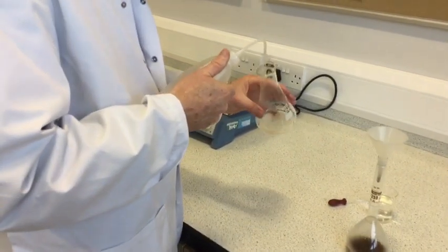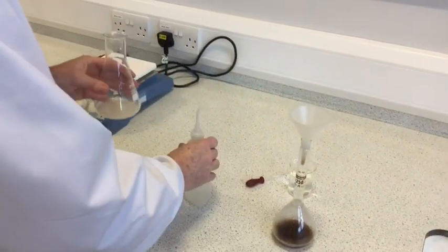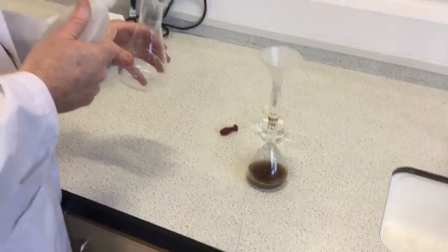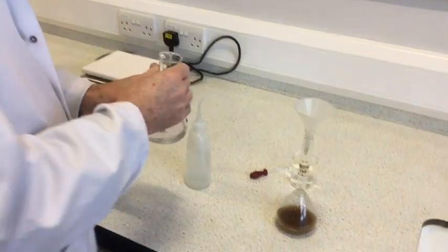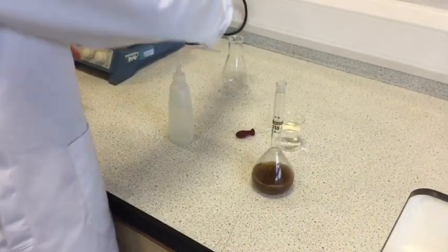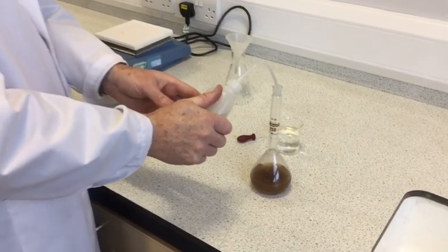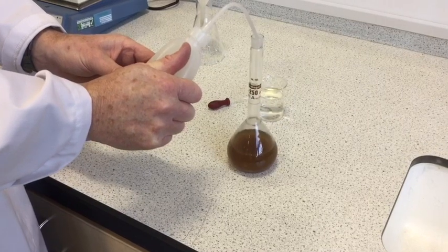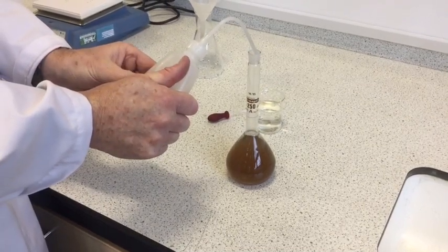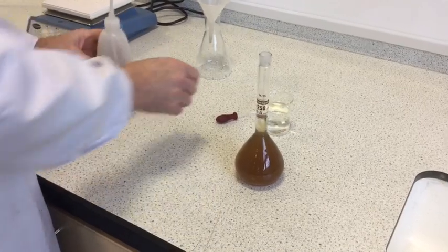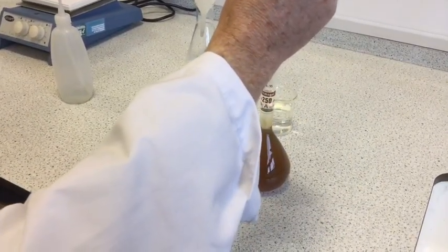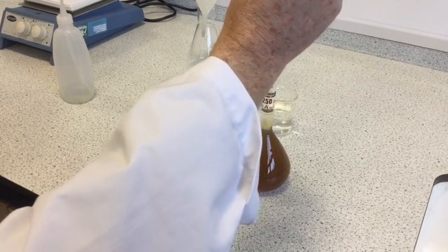We'll wash the side of the beaker. Transfer the washings. I'll do that a second time. I'll get it near to the mark. And then the last few drops I'll add using a dropping funnel. Okay, that's spot on.